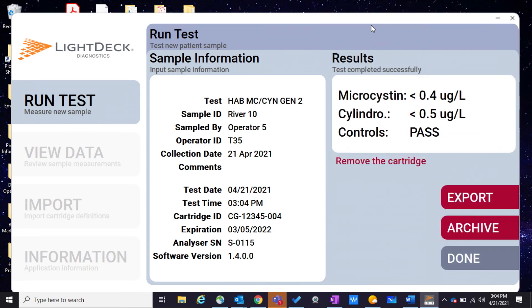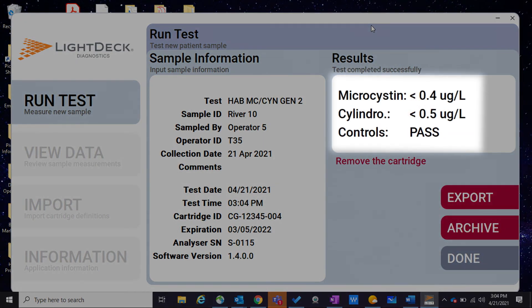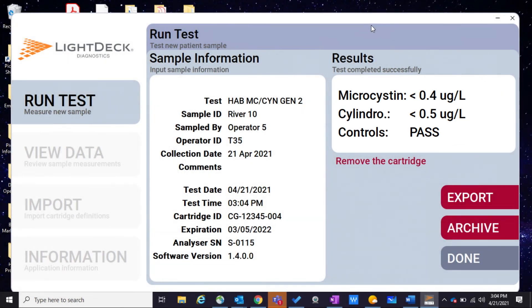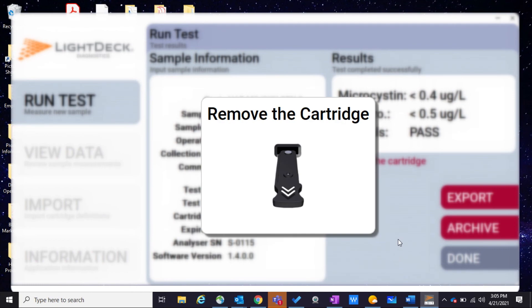After 10 minutes, the sample's microcystin and cylindrospermopsin concentrations will be displayed within the LightDeck application. Click done to release the cartridge and remove it from the analyzer.